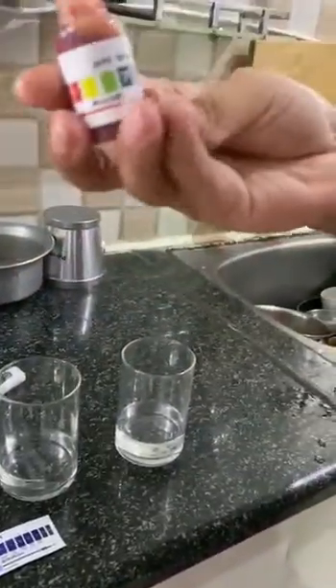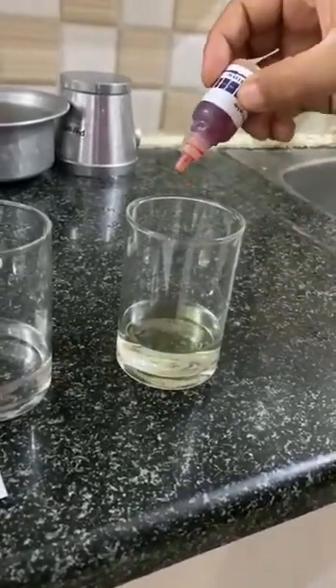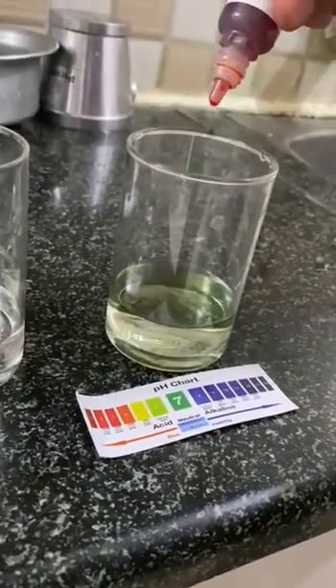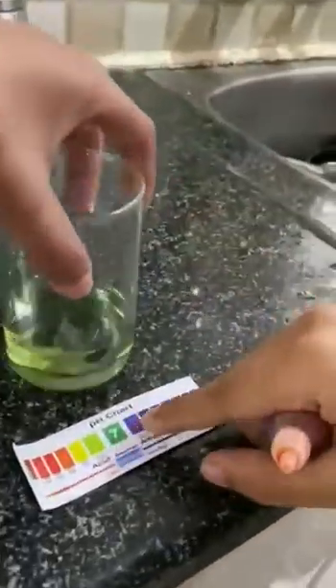So let's test their pH. This is a pH tester liquid. So let's see what is the pH for regular tap water — adding 4 drops, let's add 2 more, 6 drops total. So if you see, this looks between 6 and 7.